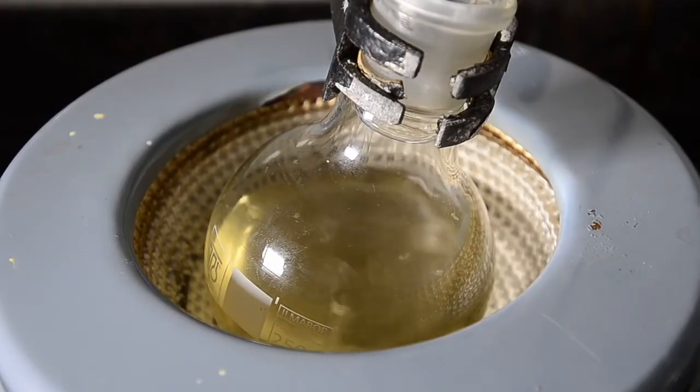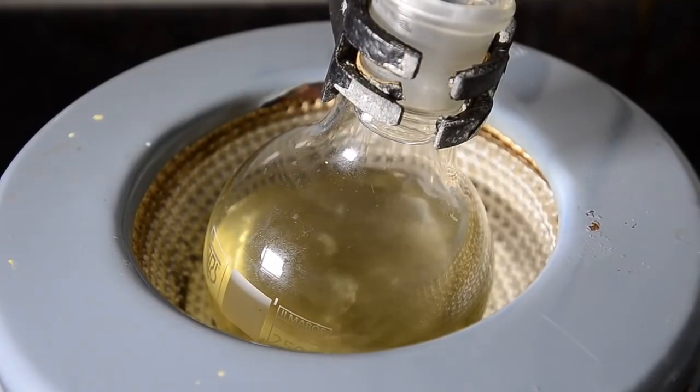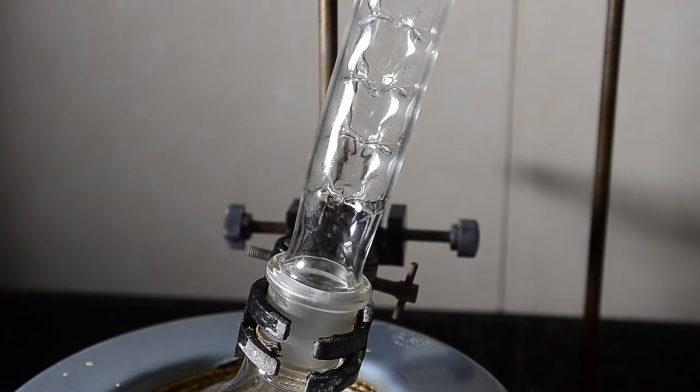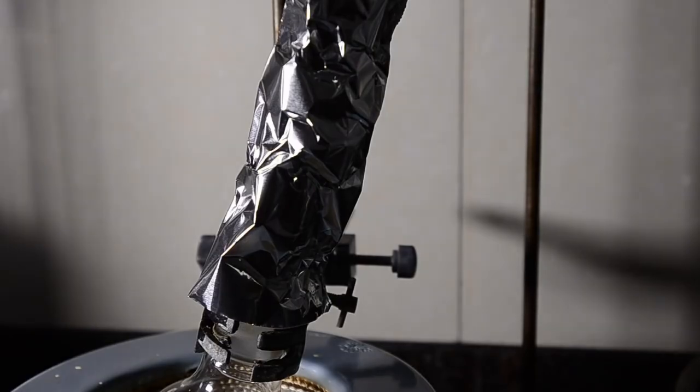Soon after heating strongly the liquid in the flask boils. And we get another nice solvent front climbing up the column. We used aluminum foil to insulate the column to make the distillation more efficient.